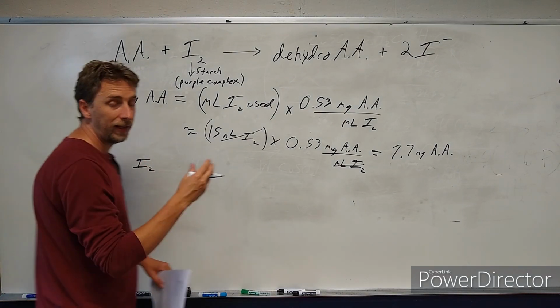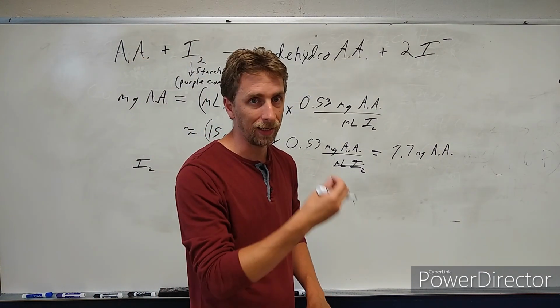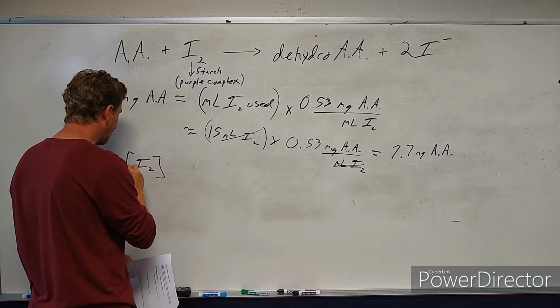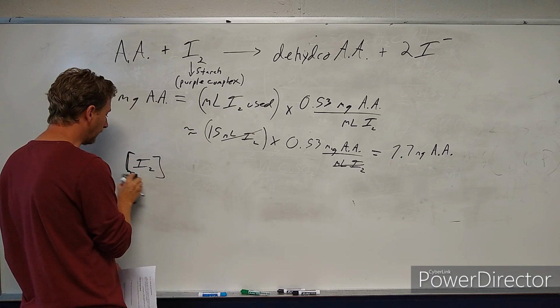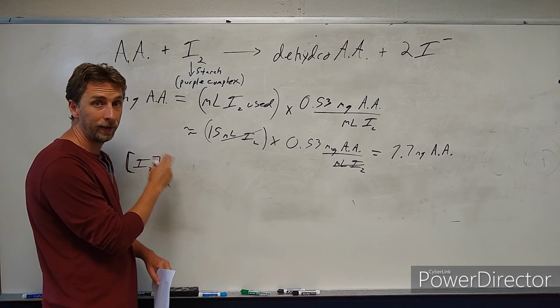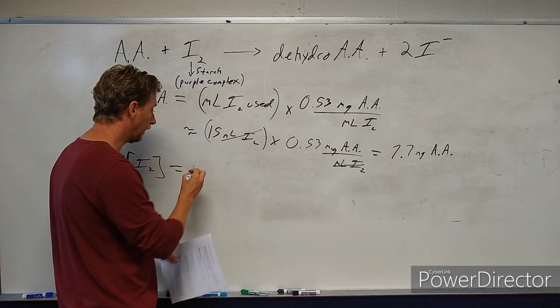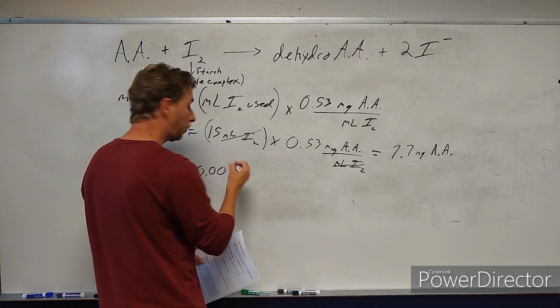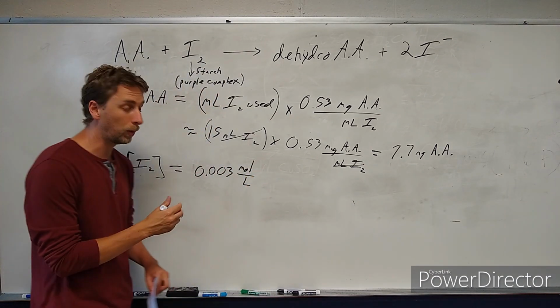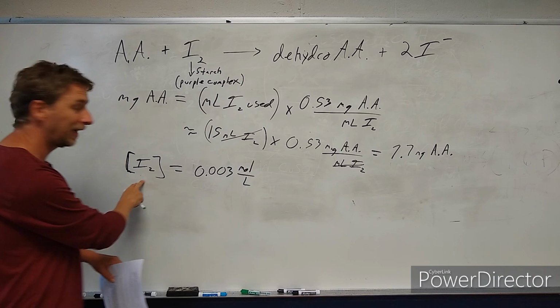Whenever you have concentrations in chemistry, and this is coming up much later in the text as well, in the regular class assignments, we have square brackets around a substance or around a formula. Square brackets around a formula means the concentration of that substance. And generally it's going to mean what we call molarity. Molarity for the iodine is 0.003 moles per liter. That's what molarity is. It's how many moles of the substance per liter of the solution. And so that's the concentration of the iodine.